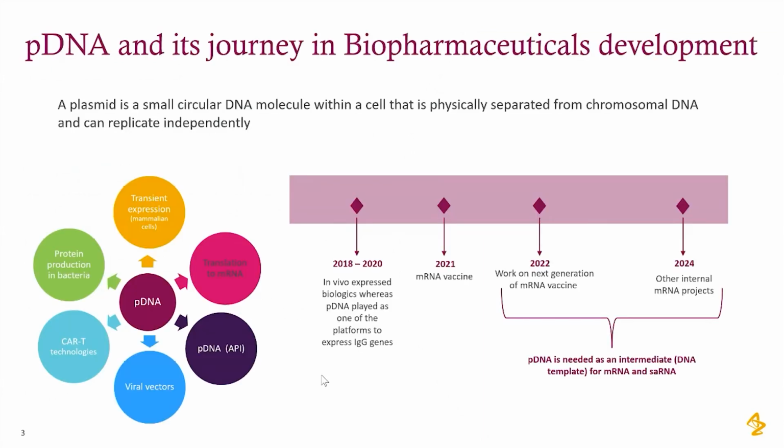So just a little bit of an explanation about the plasmid DNA journey in the biopharmaceuticals department that I am representing today. In our department, we use plasmid DNA in a variety of scientific areas and fields. The plasmid DNA journey in our department started in about 2018, when we started focusing on so-called in vivo expressed biologics, where pDNA can be one of the platforms to express IgG genes.